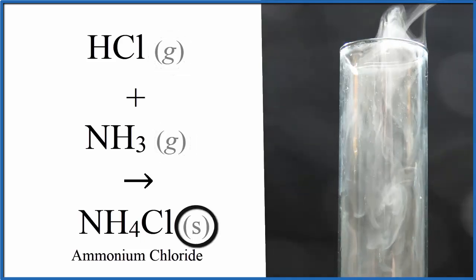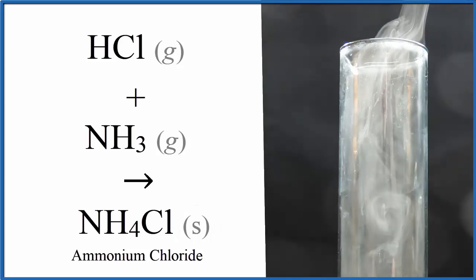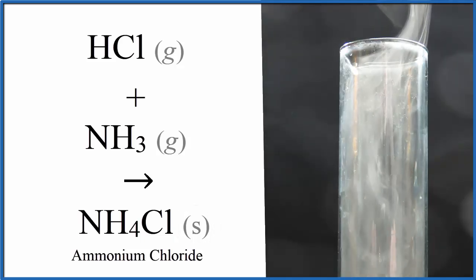It's a very fine particulate solid right now, kind of like dust or smoke. If we wait, it'll either fall to the bottom or settle on the sides of the glass.